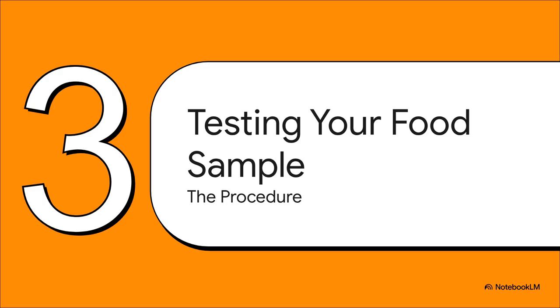It creates these super obvious floating red droplets, or you might even see a whole red layer on top. All right, so now we know the theory behind these 4 tests. Let's get down to business. How are you actually going to use all this to figure out what molecules are in your unknown food sample? Let's walk through the procedure step by step.